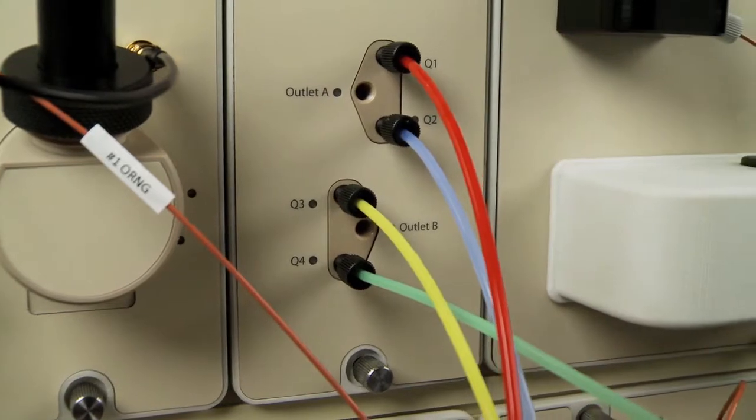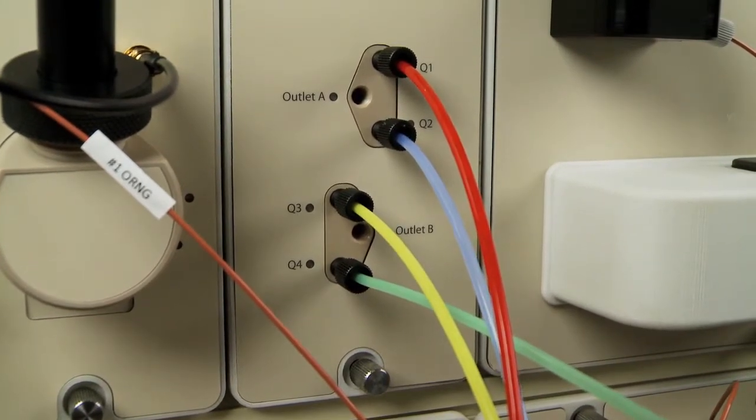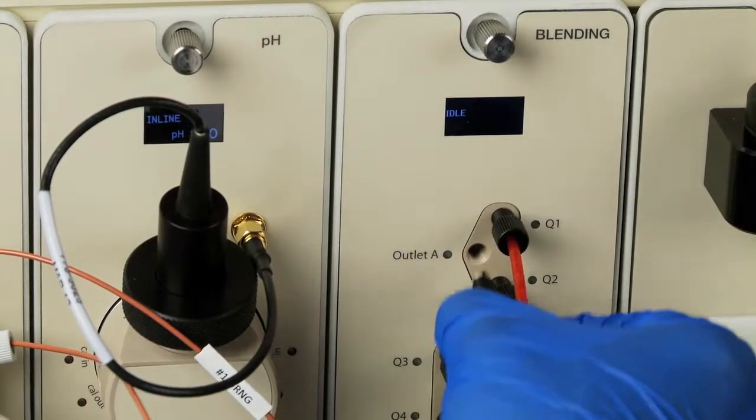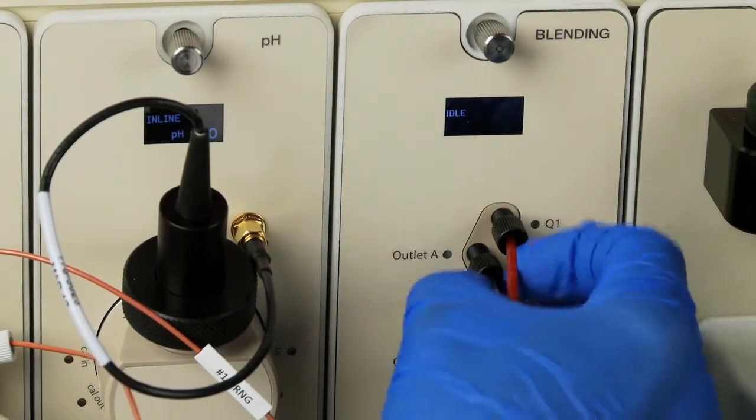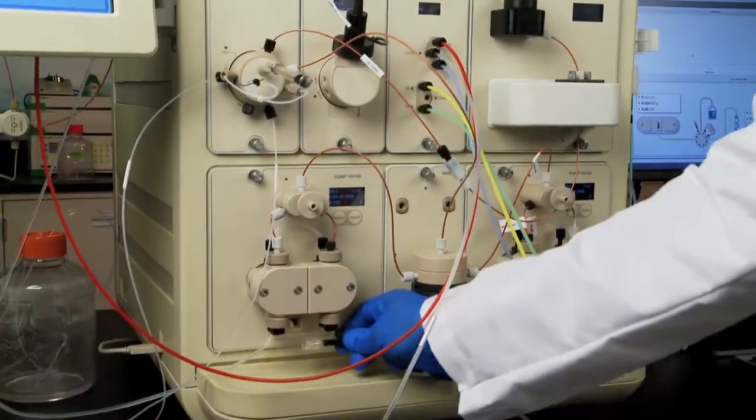Note the buffer inlet lines are color coded based on the solution that they represent. Refer to the NGC installation guide for more details. Next, attach line Q outlet to port A on the buffer blending valve and then attach the other end to the inlet manifold on pump A.